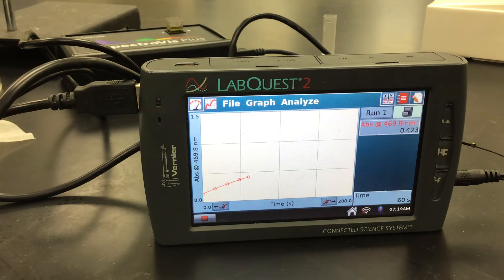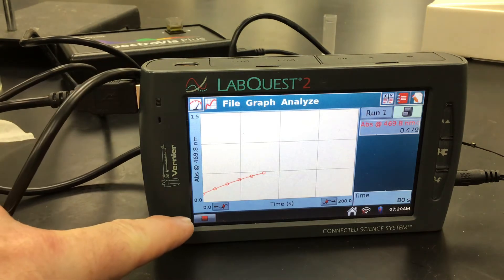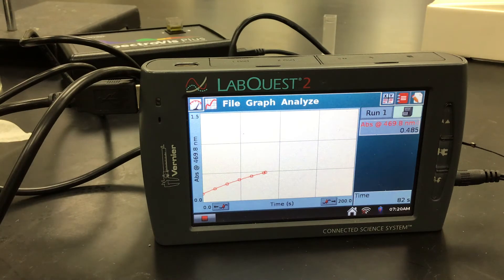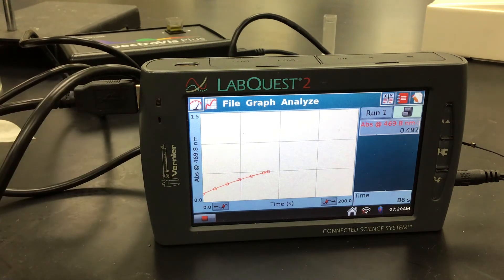And so I can start measuring those out and getting ready. One of the key things that when you are analyzing your data here is that when you go to, after this run, when you go to collect your other runs, so we can kind of compare them all in the same area on our graph, you want to make sure that when you go to collect your data again. So once this turns green, after the 200 seconds, we press this and we want to make sure that we store that data, then we can sort of overlap all of our runs together. And we want to be able to analyze our data all in the same area of our graph.